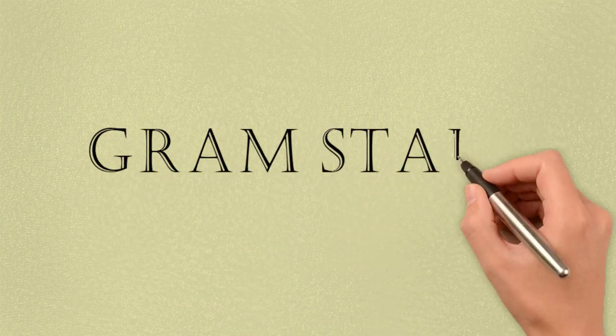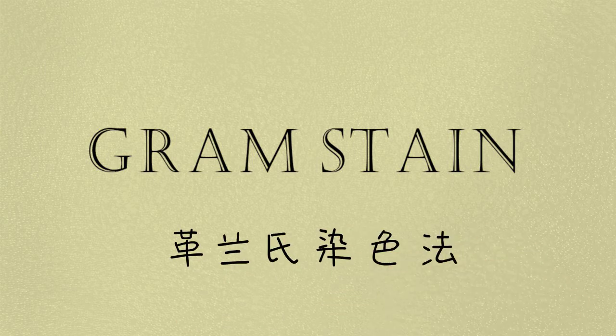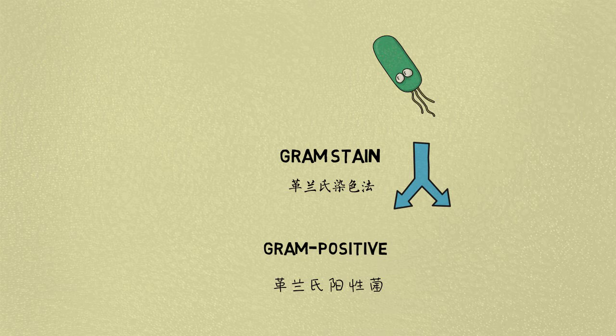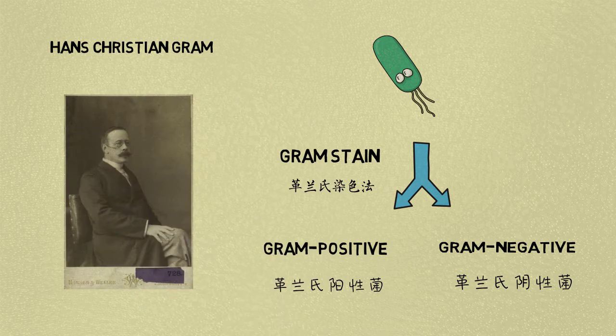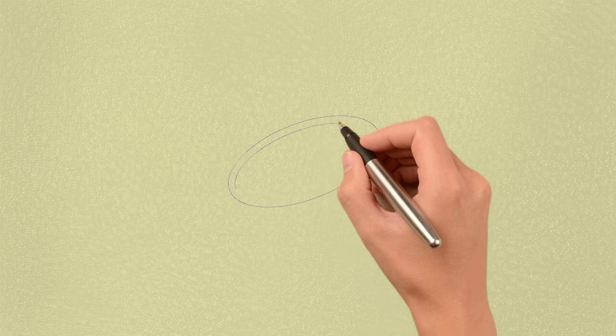Gram stain. Gram stain or gram staining, also called Gram's method, is a method of staining used to distinguish and classify bacterial species into two large groups, gram-positive bacteria and gram-negative bacteria. The name comes from the Danish bacteriologist Hans Christian Gram, who developed the technique. Gram staining differentiates bacteria by the chemical and physical properties of their cell walls.